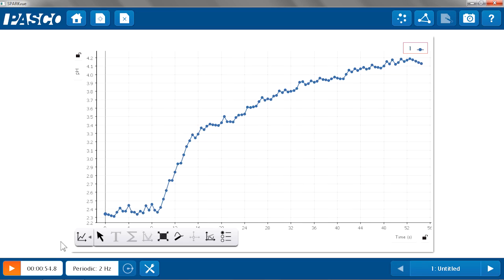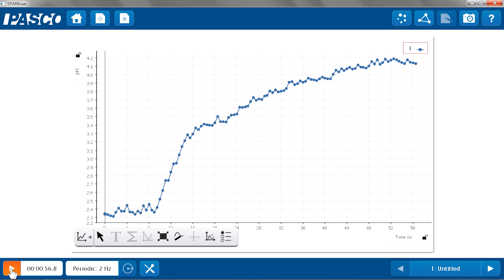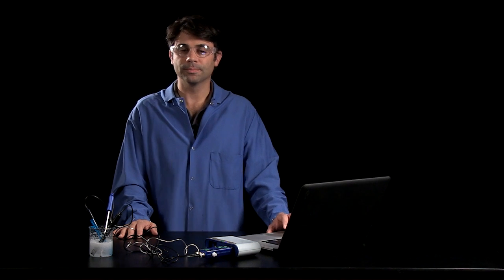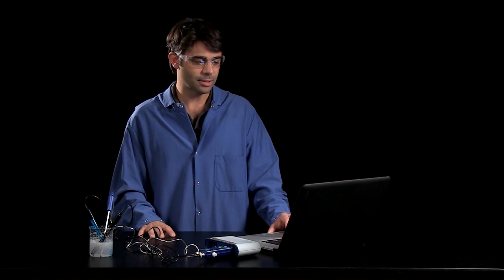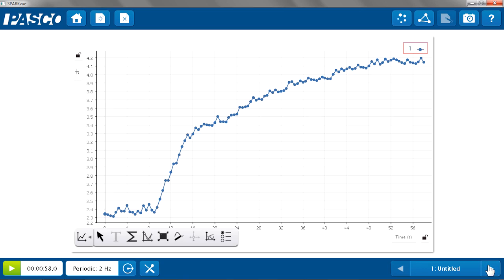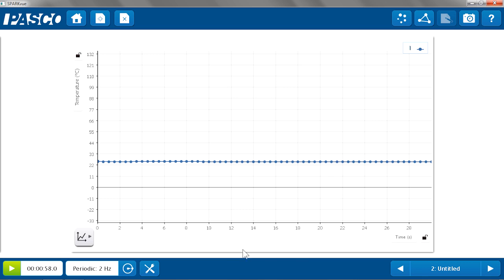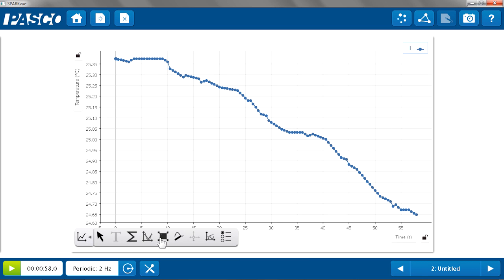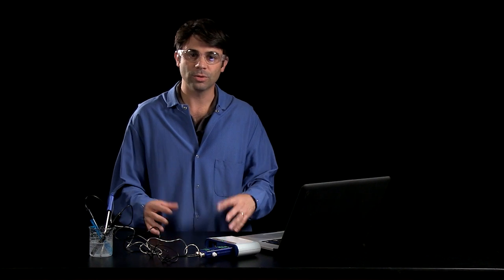I'm going to stop my data collection. Now, I'm going to look at the temperature. Again, asking students to predict what happened. And then you can reveal that, after we autoscale it, that the temperature was actually going down the whole time. After I added my Alka-Seltzer, the temperature's going down because, in this case, it's an endothermic reaction. As the CO2 is being produced, energy is being absorbed by the system.